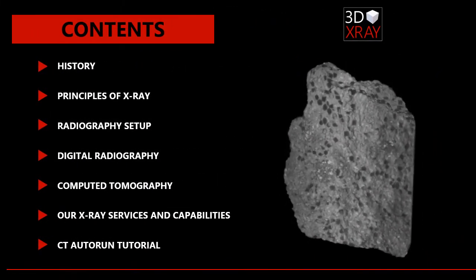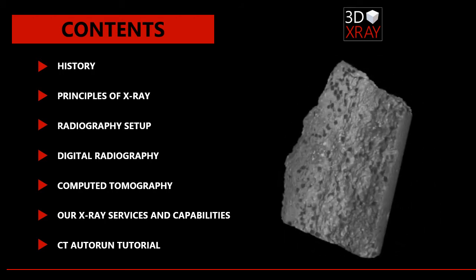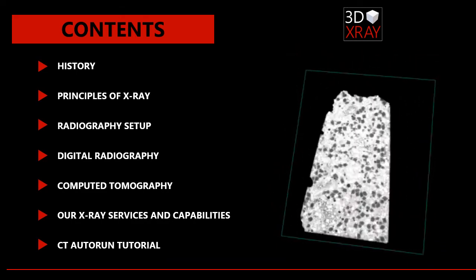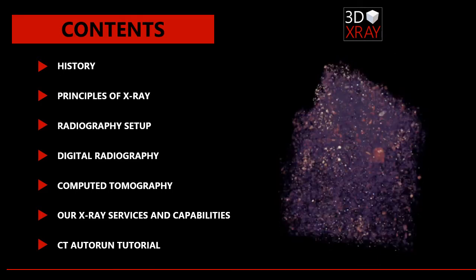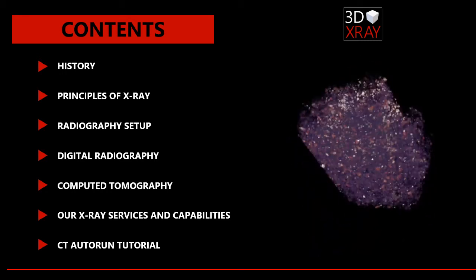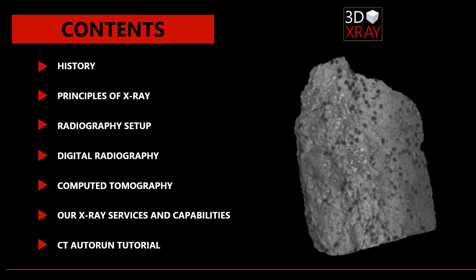So the topics that we will discuss today are about the history, the principles of X-ray, radiography setup, what is digital radiography, what is computed tomography, and our X-ray services and our capabilities. Also, we have a bonus content. It is the CT Auto Run tutorial.